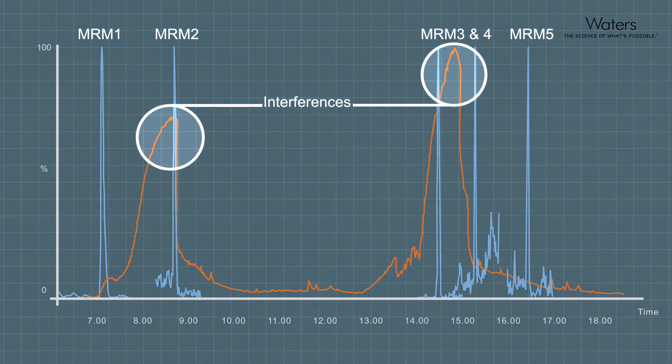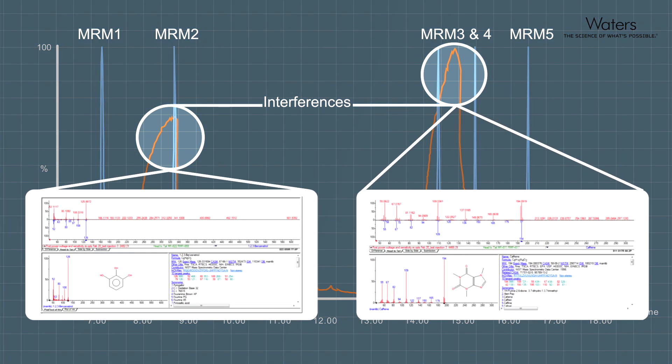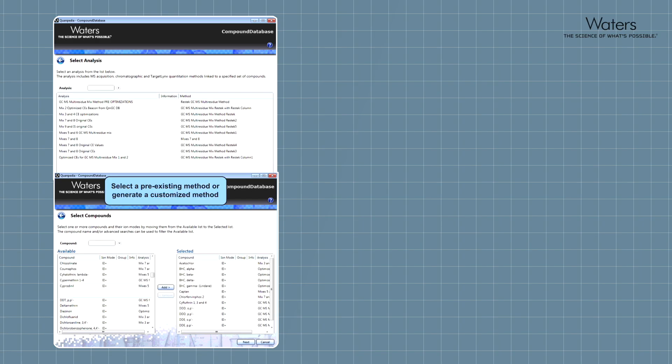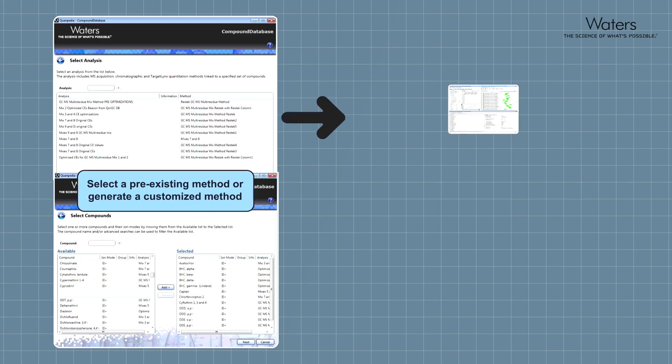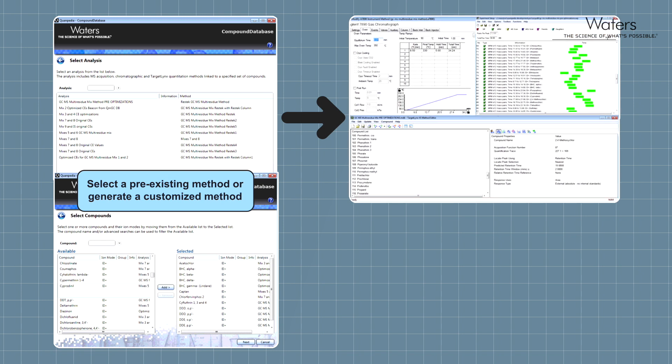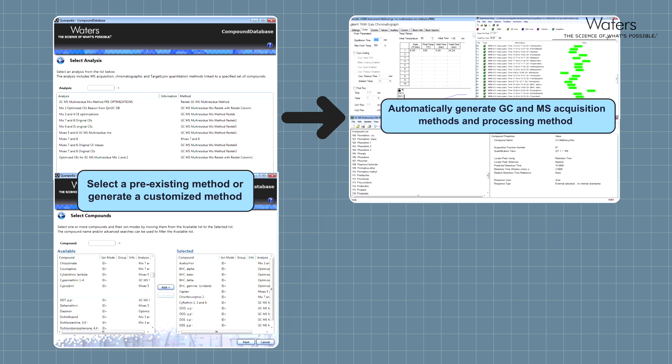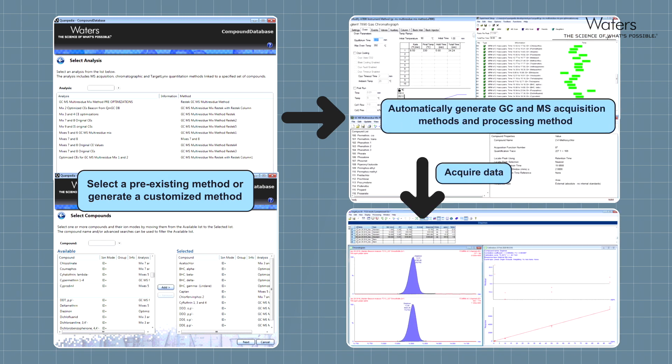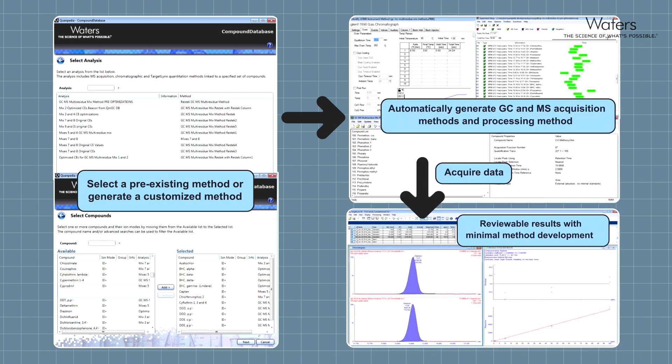Lengthy method development time is also no longer a barrier to productivity. Methods can be created or modified easily with Quantpedia method development database-driven workflows, significantly reducing method development time.